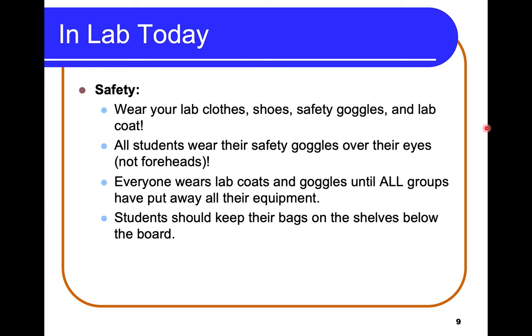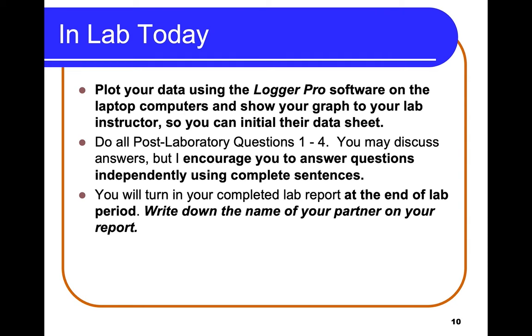At that point, when all groups have put away all equipment, you can sit down at the benches in the lab and everyone can take off their goggles. Students should keep their bags on the shelves below the whiteboard. We do this because bags are a tripping hazard in case there was a fire.